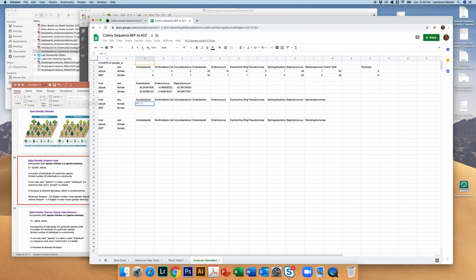and then we want to use a technique that's going to prevent the value of the grand total from changing as we go through this. So you want to type in $ and then the cell of the grand total. So the cell of the grand total here is M3.